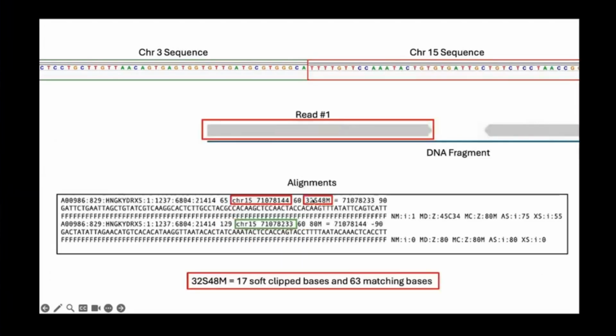That's one method. Another possibility is if the fragment is off to one side like this, so one of the reads goes directly across the breakpoint.